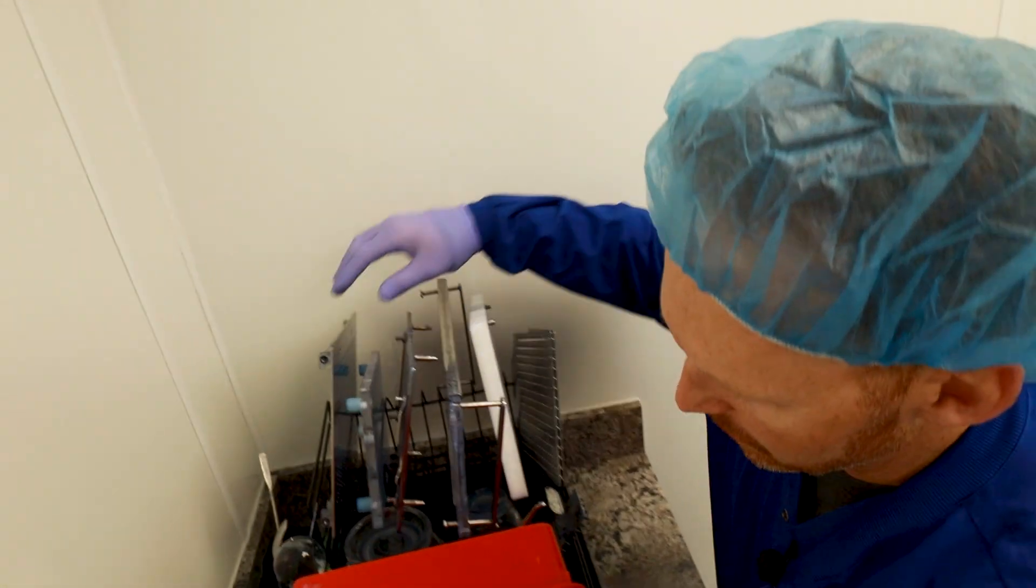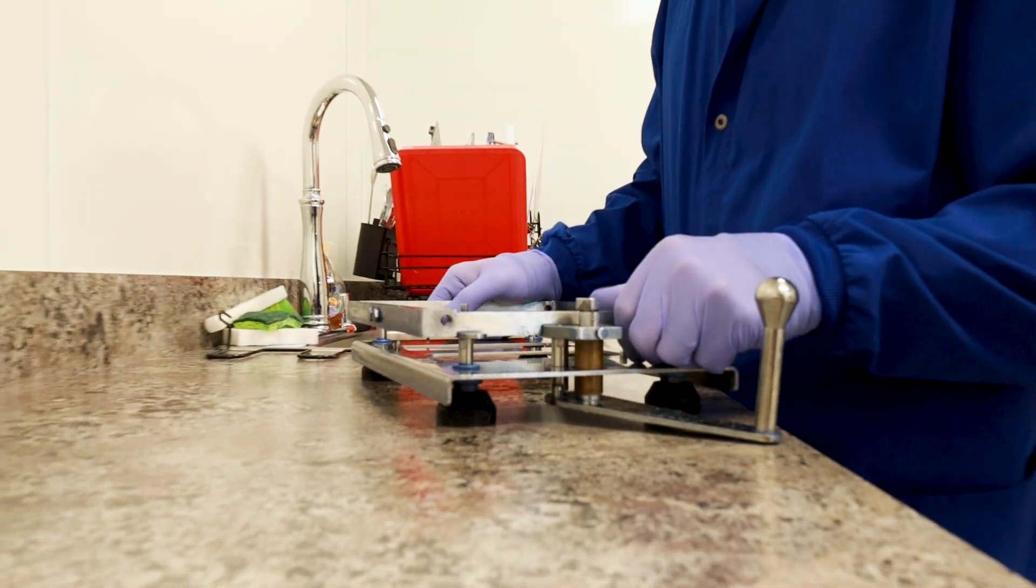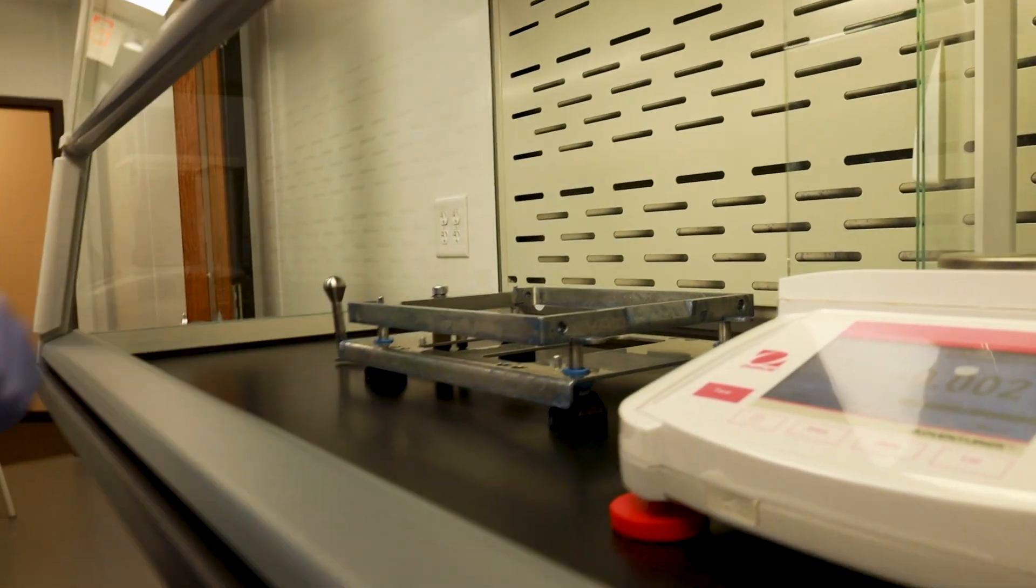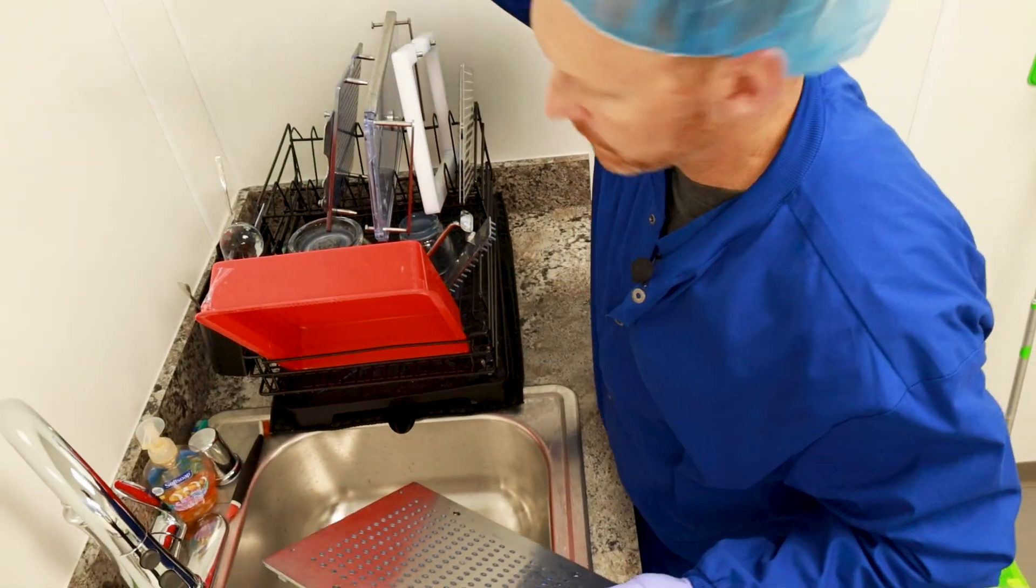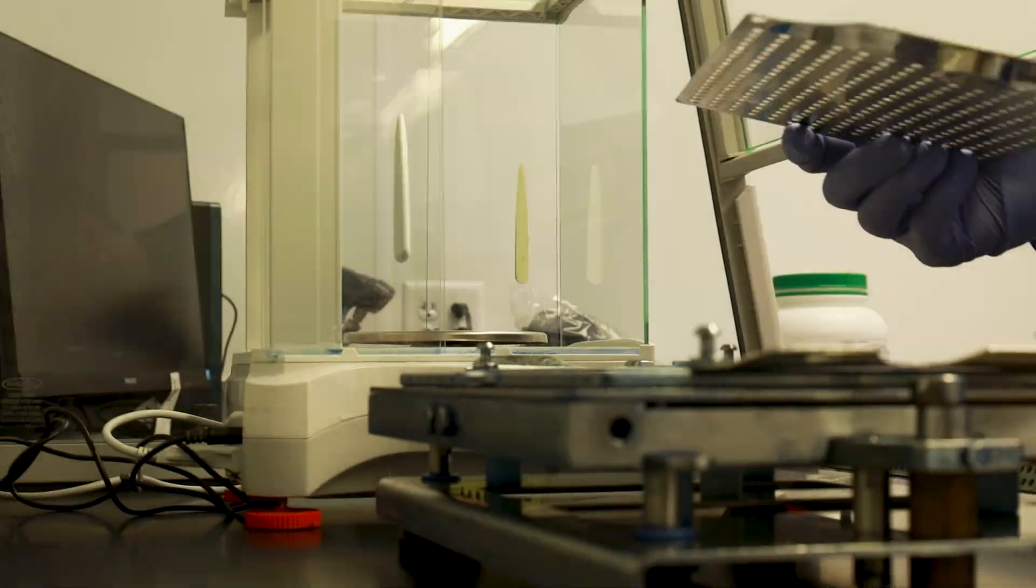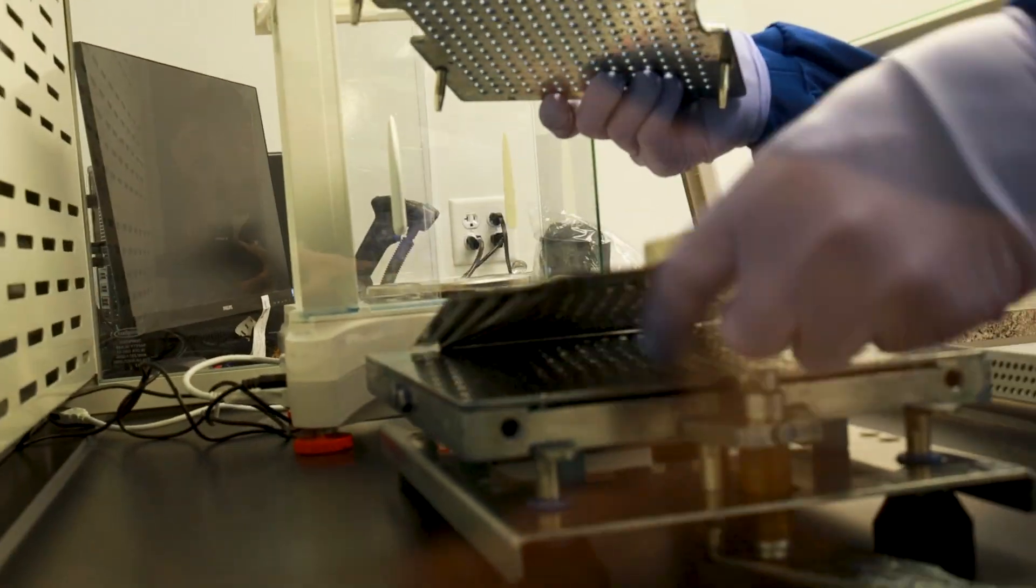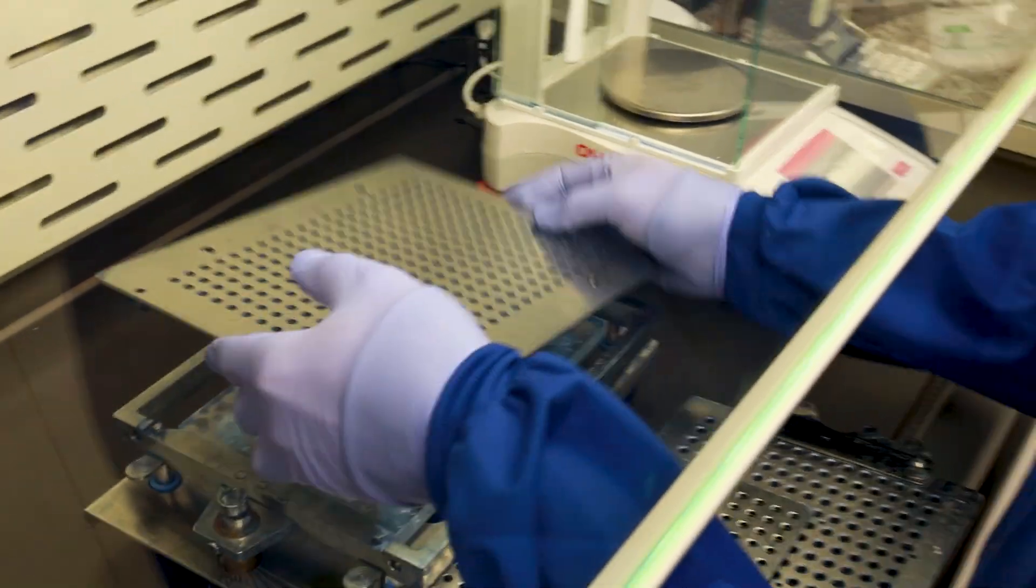We are going to get some pieces of equipment out. One important thing, this may look dirty, but this is only used for methylene blue. We specifically just have one specific capsule machine that only touches methylene blue. So no cross-contamination, which is important, obviously. And let's get some more pieces of the puzzle here. There's a class you can take to put all this together. And there's training manuals, training documents.